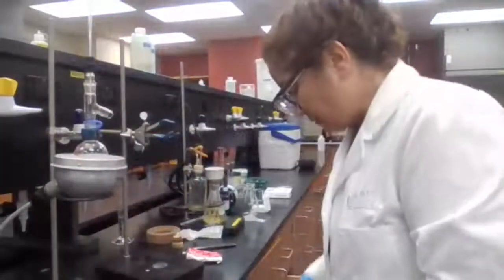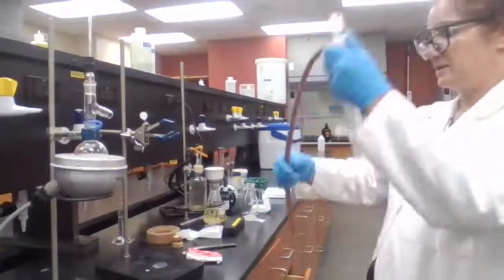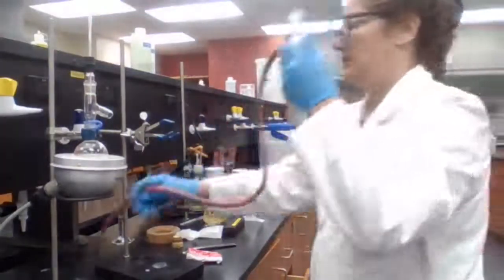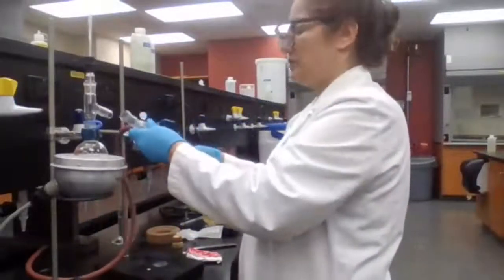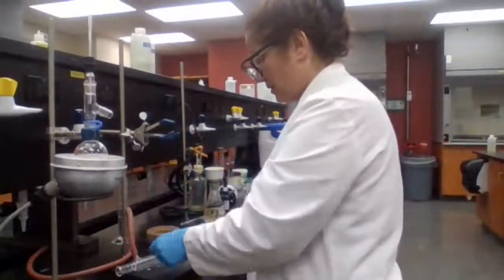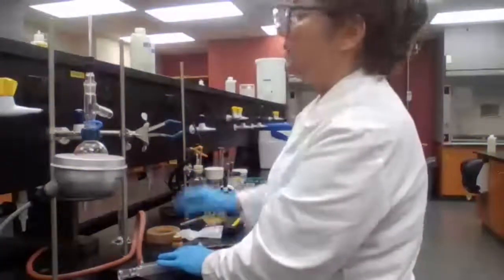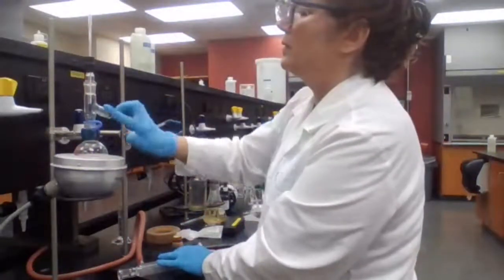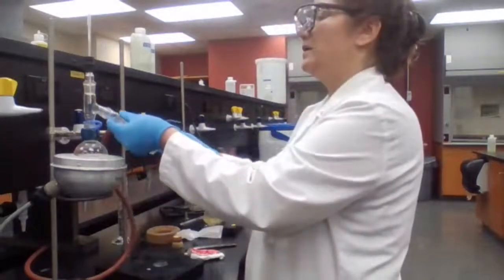Just going to add the thermometer, and now I have my condenser. Going to make sure the glass joint is greased. Grease the glass joint and connect.